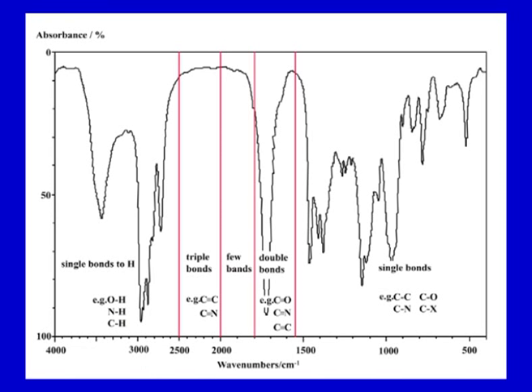There are generalized tables of the positions and relative intensities of the absorption bands that have been established for certain groups. So, the strong absorption bands or characteristic spectra in a particular region of wave numbers, say from 4000 to 2500 per centimeter, usually come from stretching vibrations between hydrogen and some other atoms with a low mass.